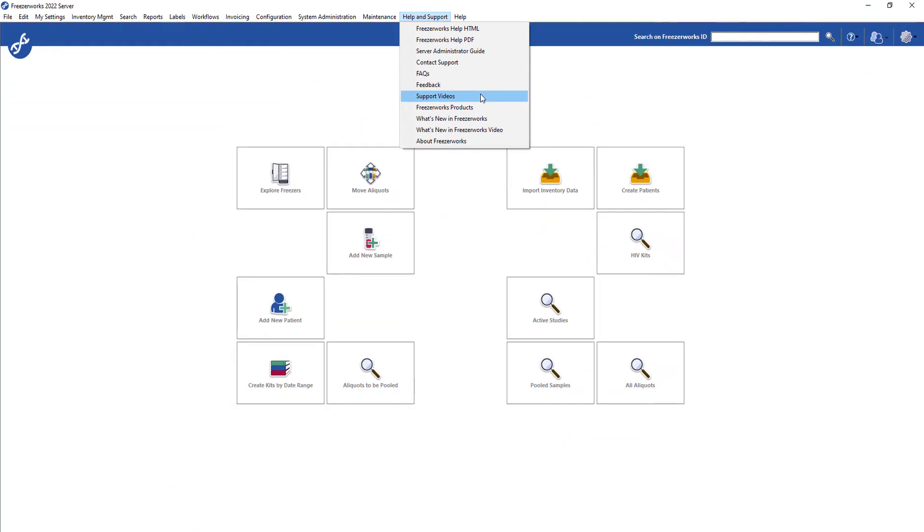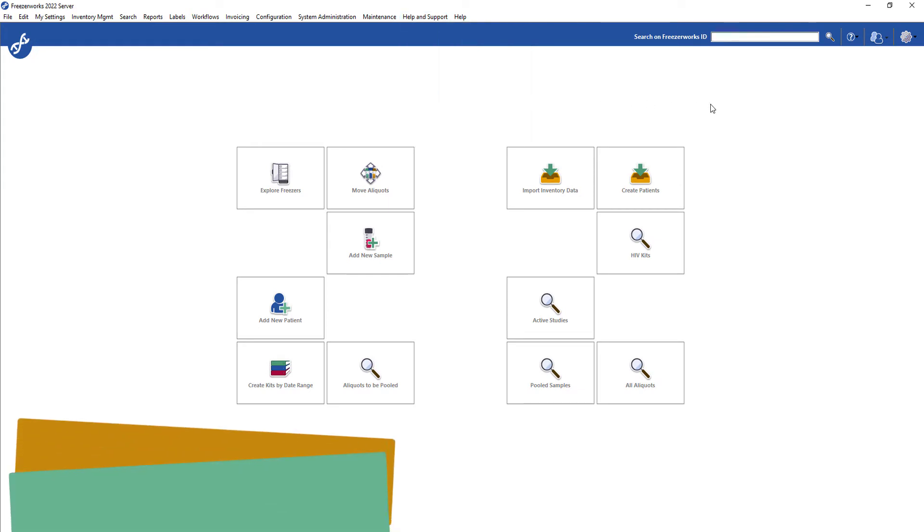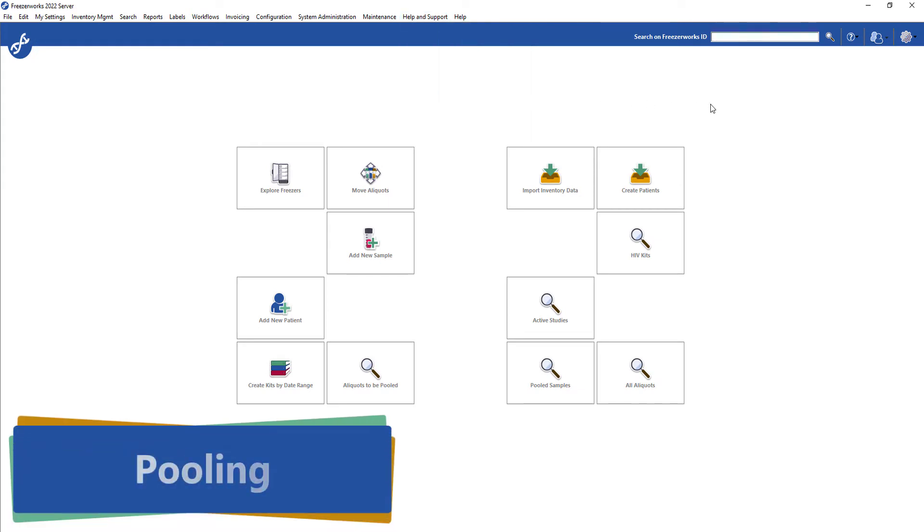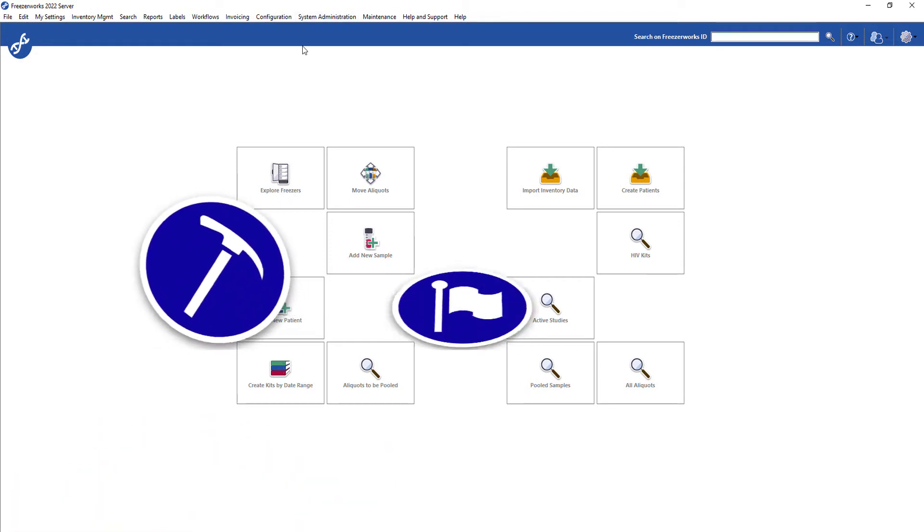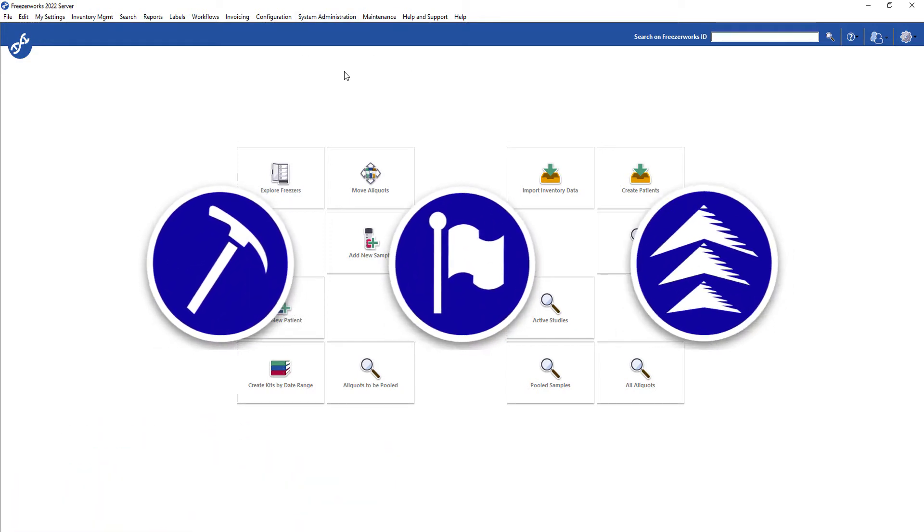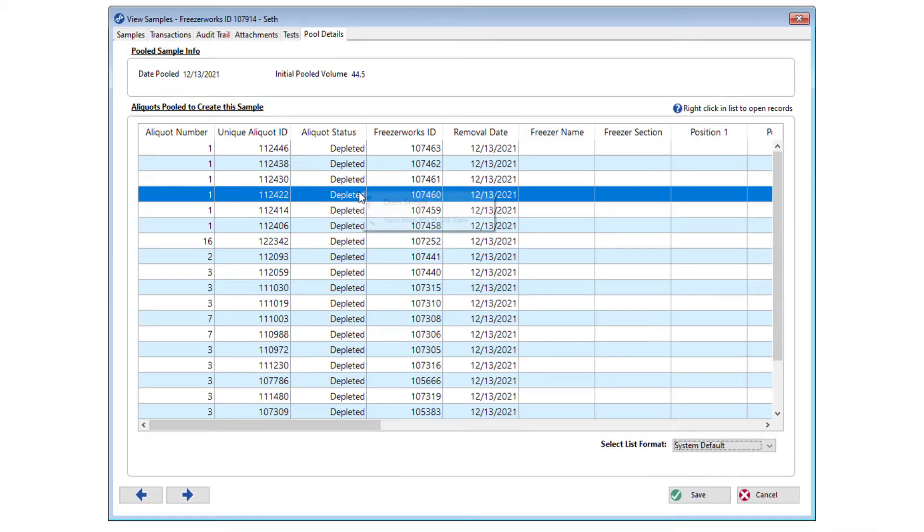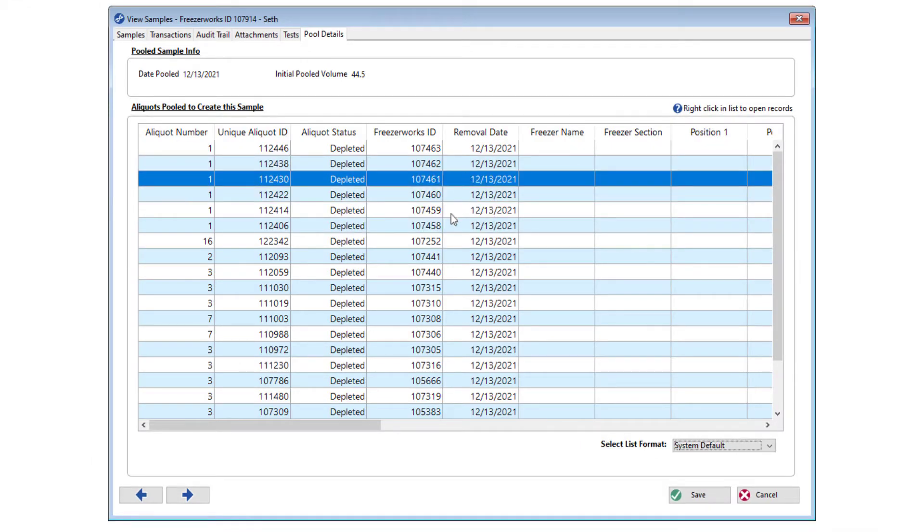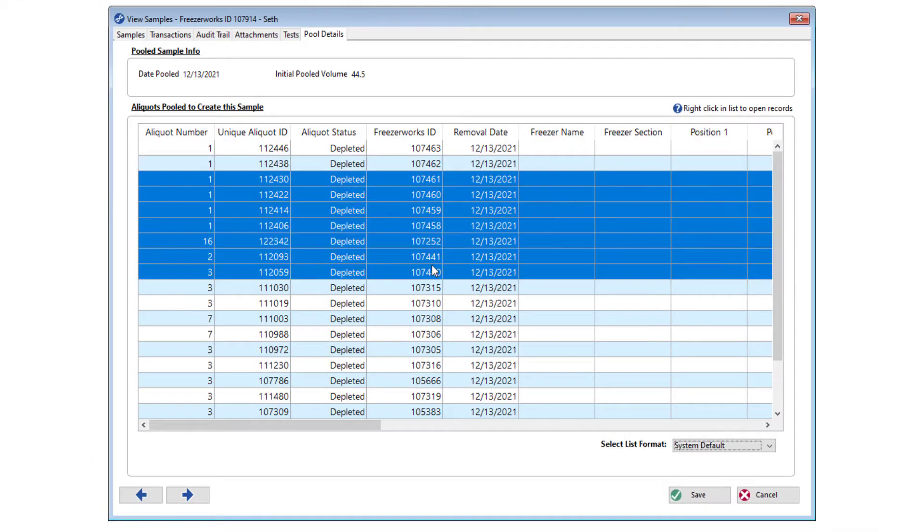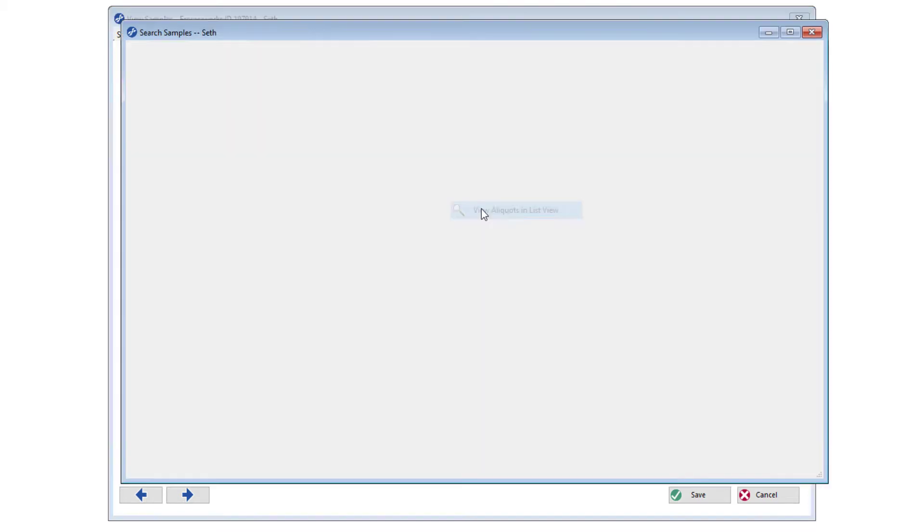Alright, the most substantial update we have made to FreezaWorks 2022 is the addition of pooling workflows to the Ascent, Summit, and Pinnacle Editions. Pooling has been a major part of numerous labs and testing processes for many years now, and the advent of COVID-19 only made it a more pervasive practice.